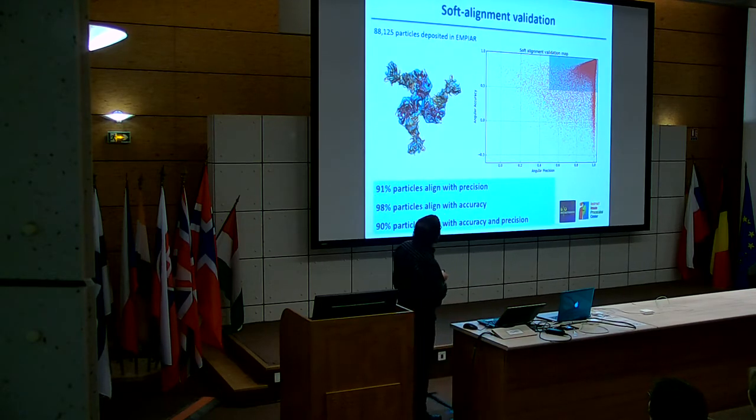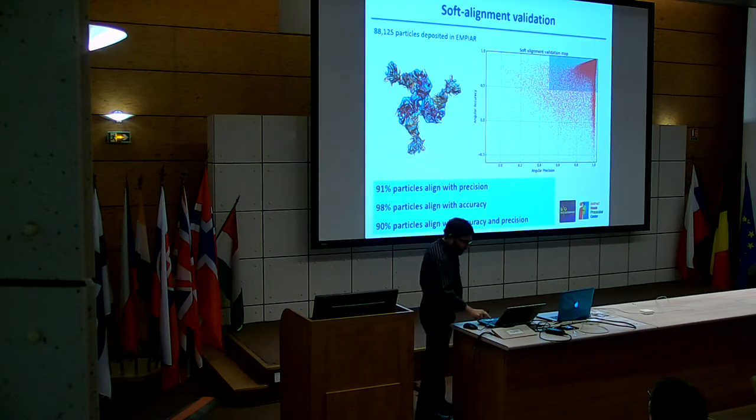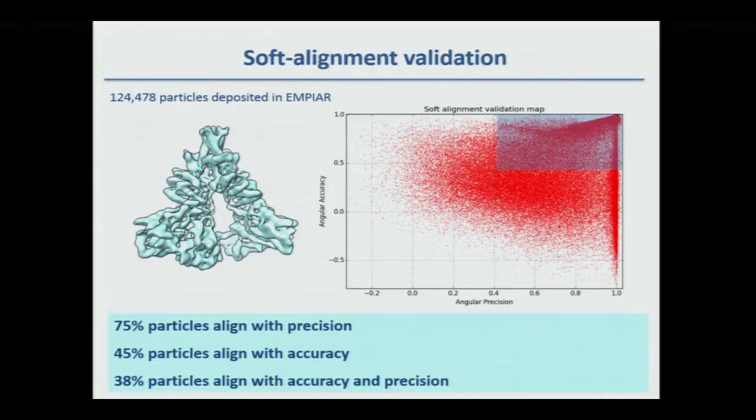This is Siran's reconstruction, between 0 and 1, 0 and 1. This is the magic corner. This is the corner in which most images should be, and they are not. Very clear, black and white. So no need to argue anything.